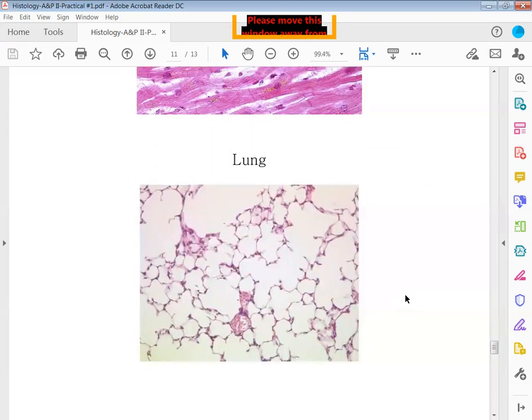Then we go to the lung. The lung looks like airy popcorn. So you're seeing each one of these little popcorn kernels. It's very airy looking. That is a lung. That is all you have to tell me right now, is that this organ or gland is a lung.